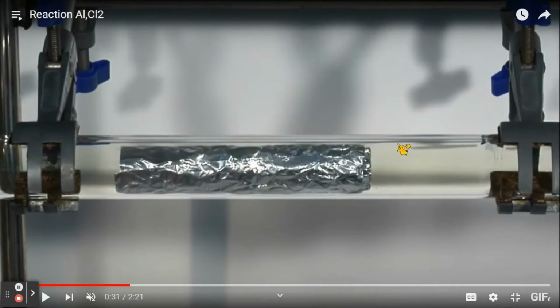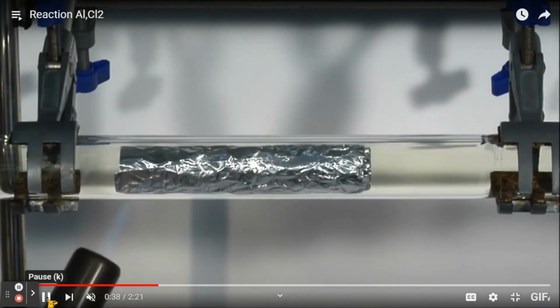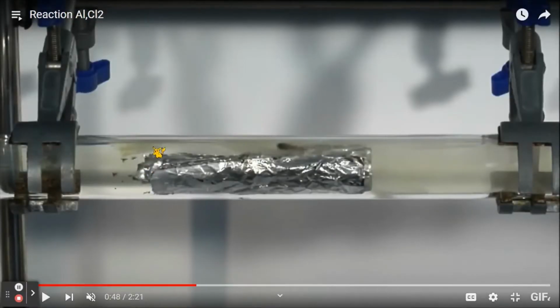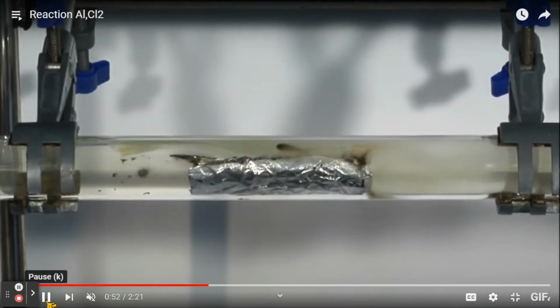You can recognize that chlorine by that pale green color. And now what they are doing is heating it, just a quick, gentle burst from a Bunsen flame. You'll actually see that it is an extremely exothermic reaction. I'll just pause it over there and bring it all the way through. So you can now start to see that the aluminium is reacting. And there we go. Okay, so you now are forming this aluminium chloride over here.